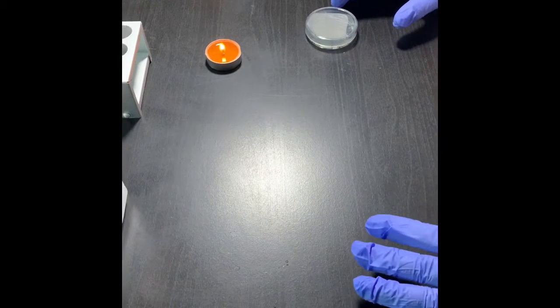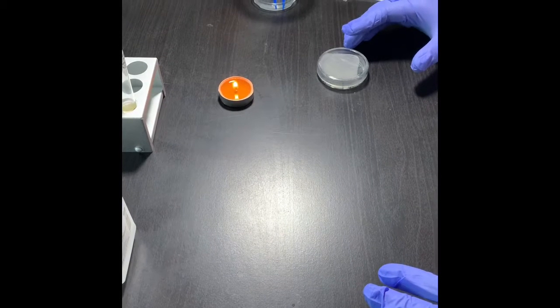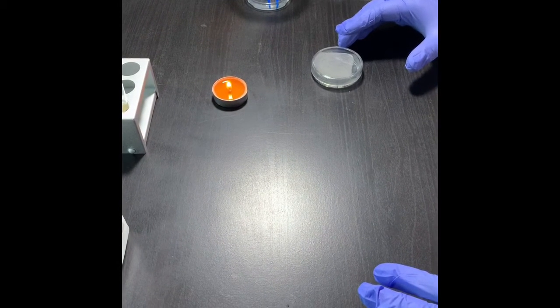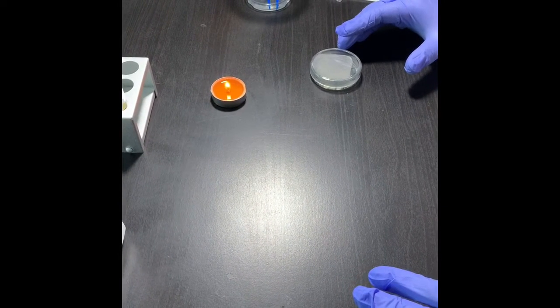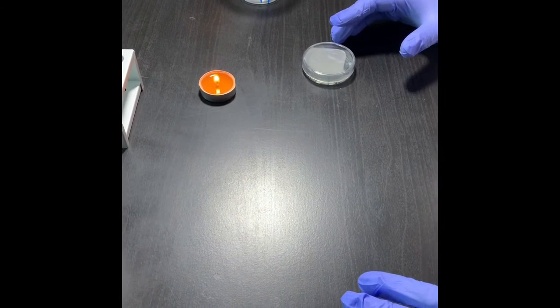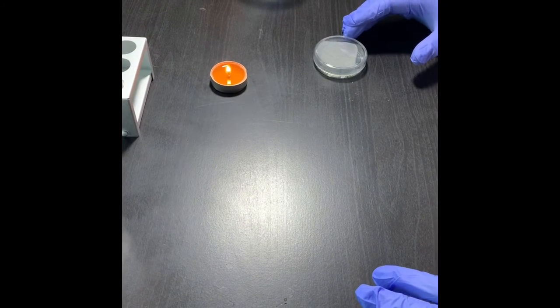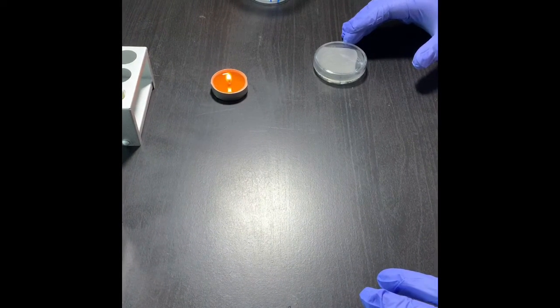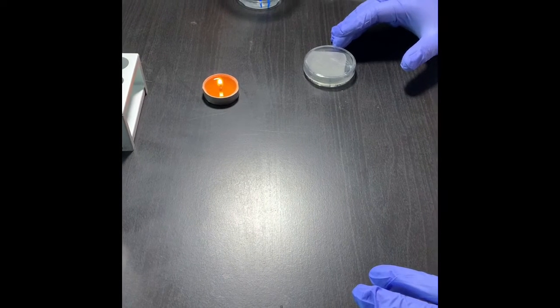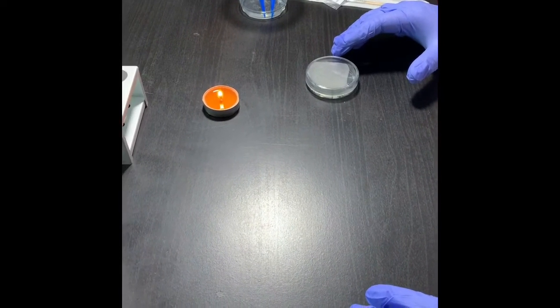So today I'm going to show you lesson 7, which is about the Kirby-Bauer diffusion test. It is a test of antibiotics, to see whether a microorganism is susceptible or resistant to an antibiotic, that we will be testing today.